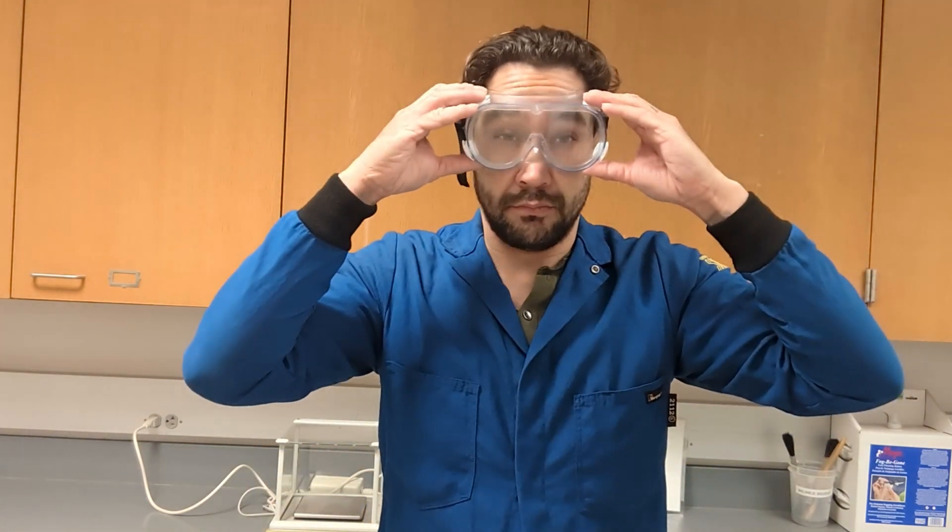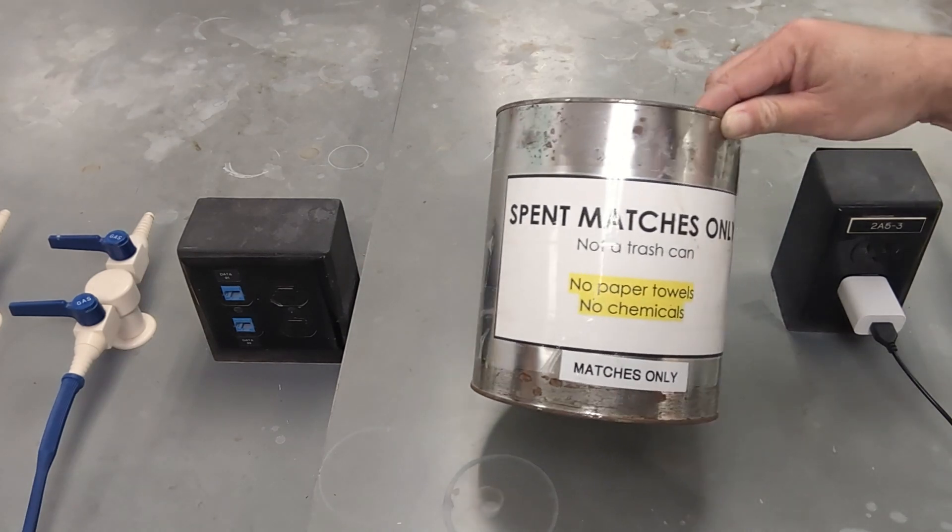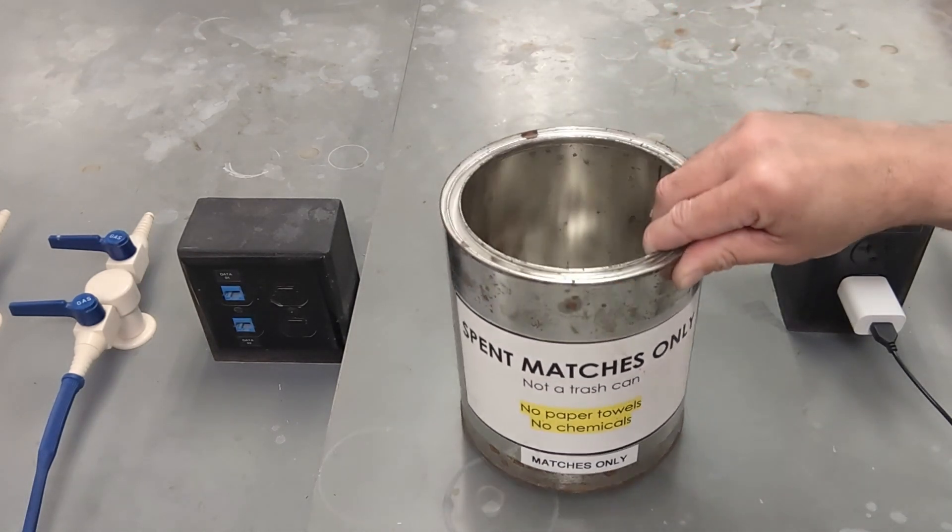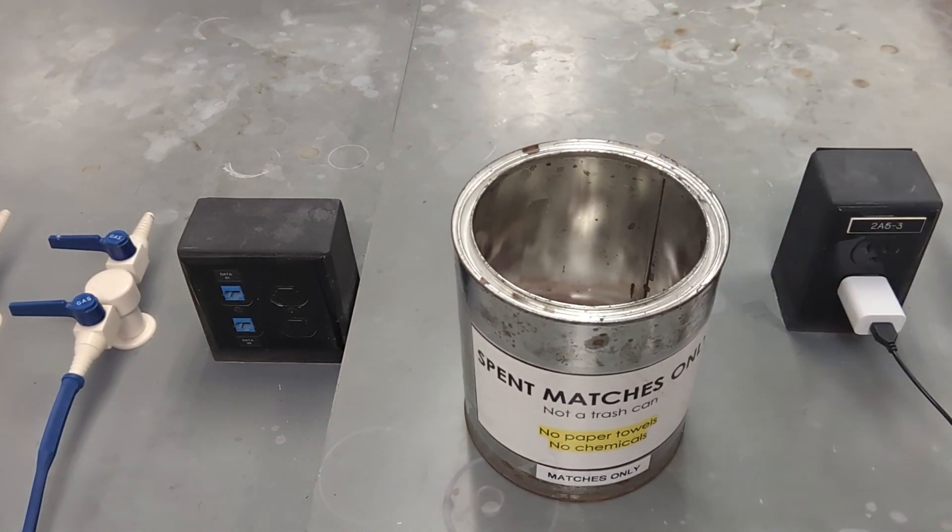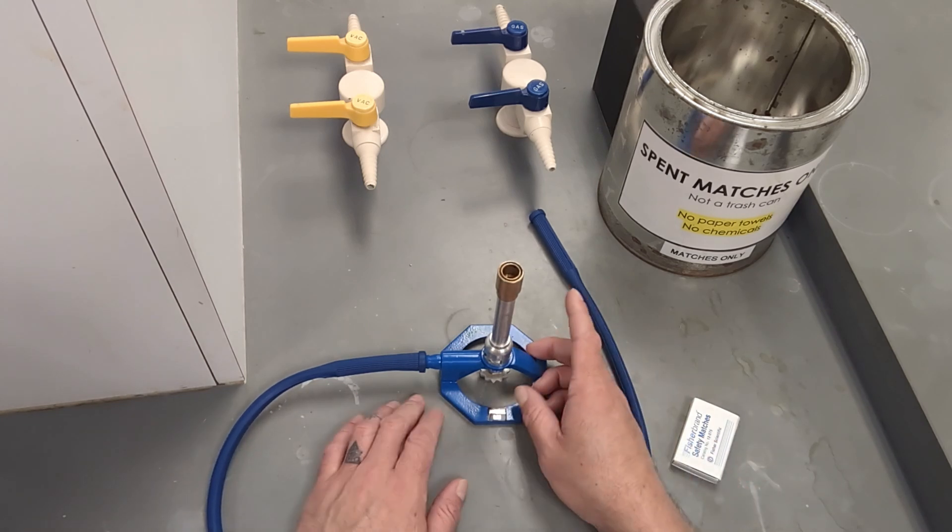And that you also have your lab goggles. If you are a person with long hair be sure to tie it back as well. And one more thing that you'll need is a designated container for your spent matches. In this case it is an aluminum coffee can.